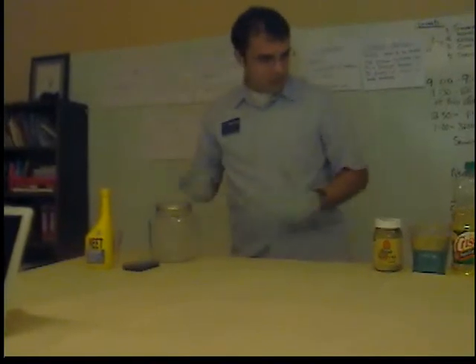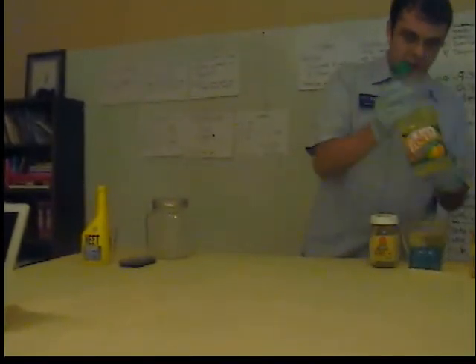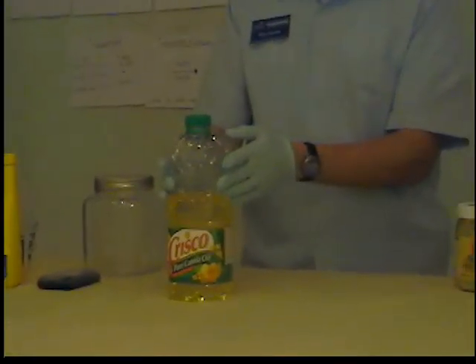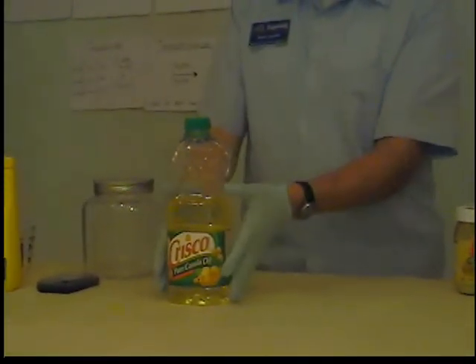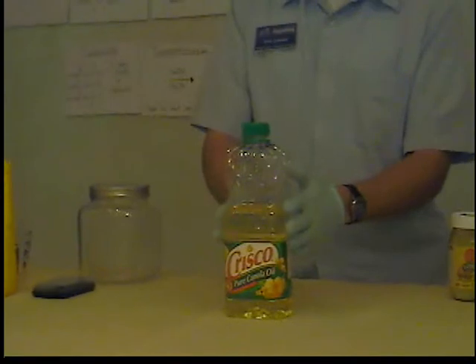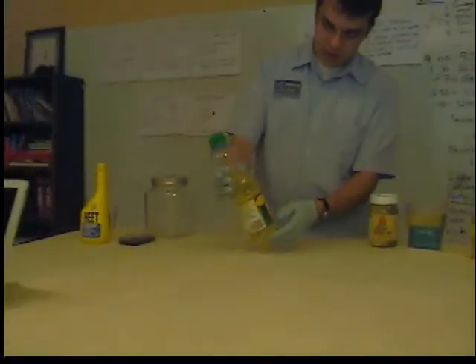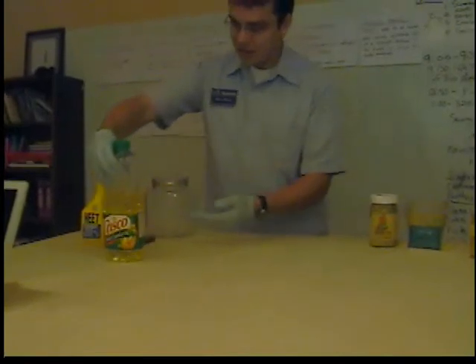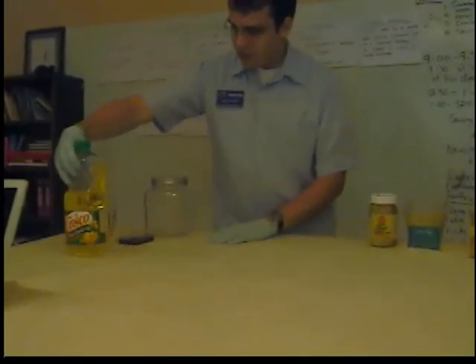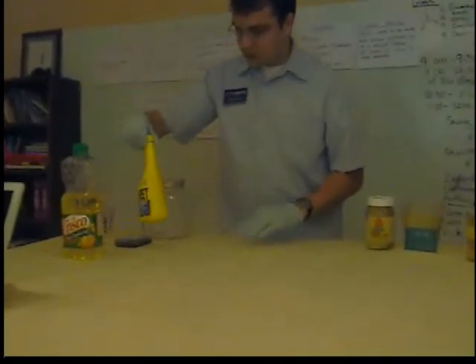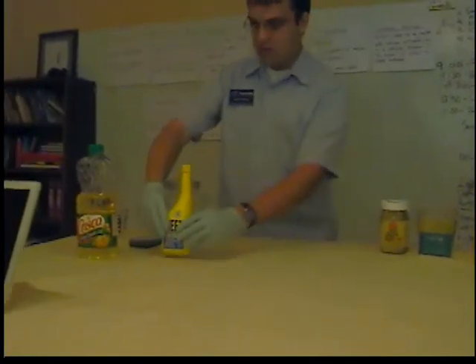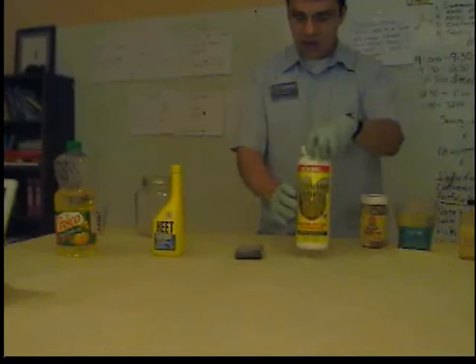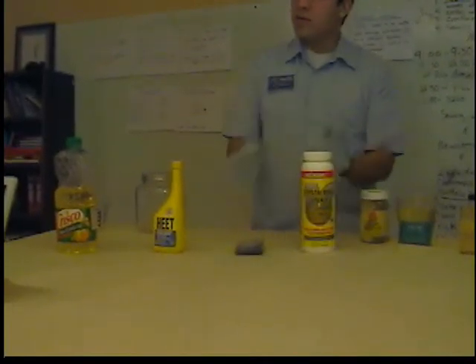The first thing we're going to do is take our oil. This oil has been preheated to a little bit over 100 degrees Fahrenheit, so it's fairly warm. This is exactly a liter of vegetable oil — Crisco canola oil in this case. What we need to do is measure out the amount of methanol and the amount of lye that we need, and we want to be very careful when doing both of these things.